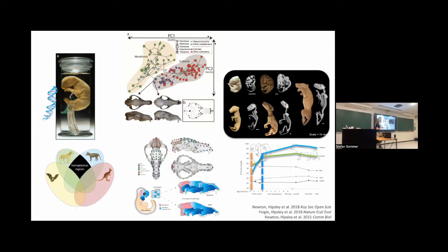And so we could, in this case, landmark the skull more densely, and then look at patterns of integration over time. So we compared thylacine and wolf and tried to increase our specimen sampling. And here we also look at differences in mesoderm versus neural crest cells and how that affects those patterns. So that was a really nice study.